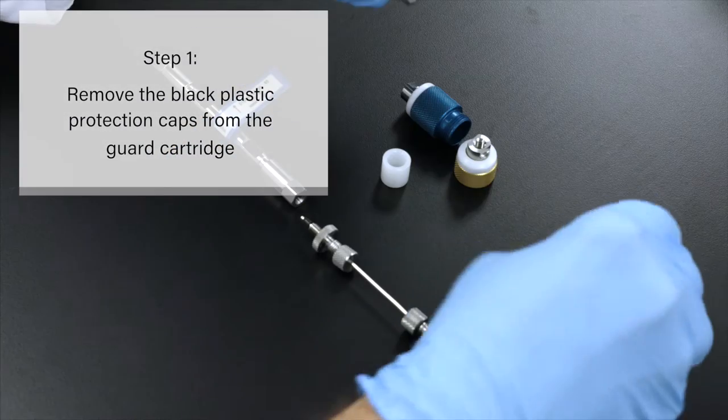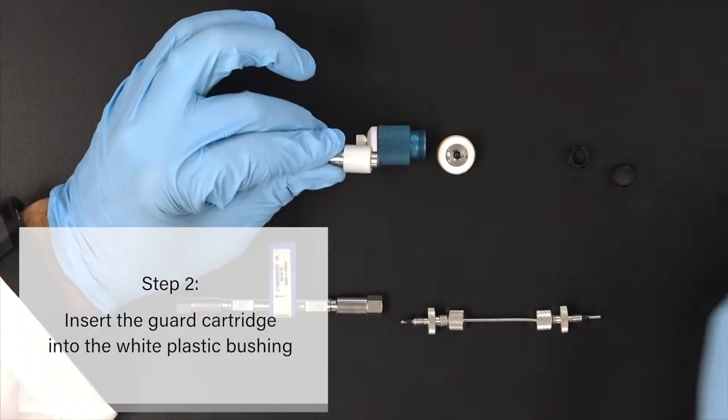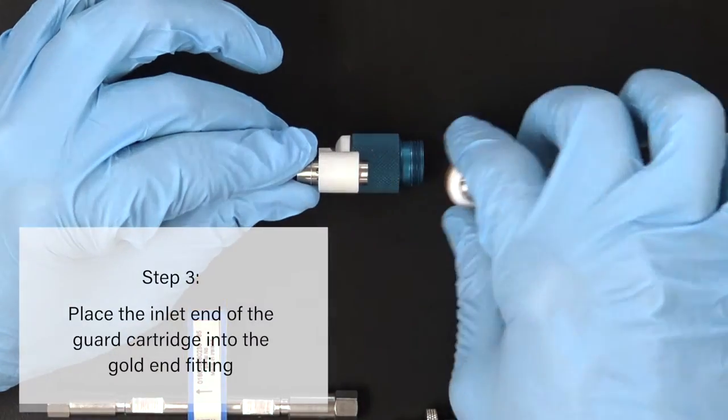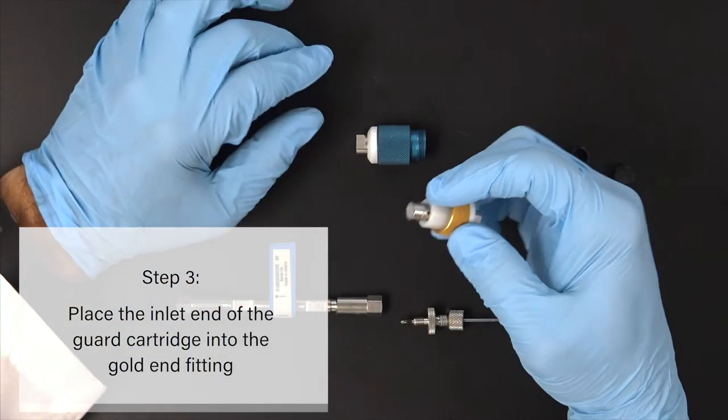Remove the black plastic protection caps from the guard cartridge. Insert the guard cartridge into the white plastic bushing. Place the inlet end of the guard cartridge into the gold end fitting of the Sentry Guard Cartridge Holder.